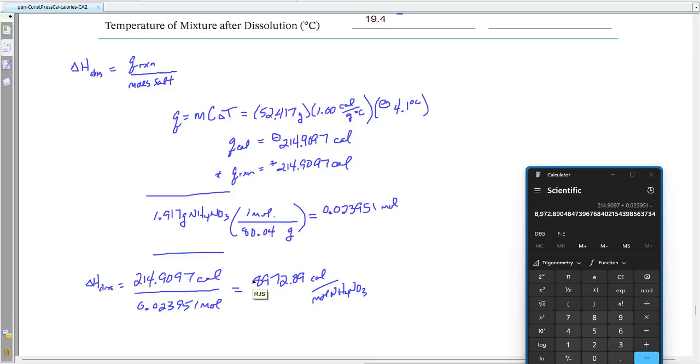The literature value on this one, if you go look it up, comes out to about 6,100. So again, within the bounds of experimental data, I'd hope if I actually collected this data, it would look a little better, but I'm using the stuff that LabFlow gave me. So I'm in the right ballpark. That's good enough for me.